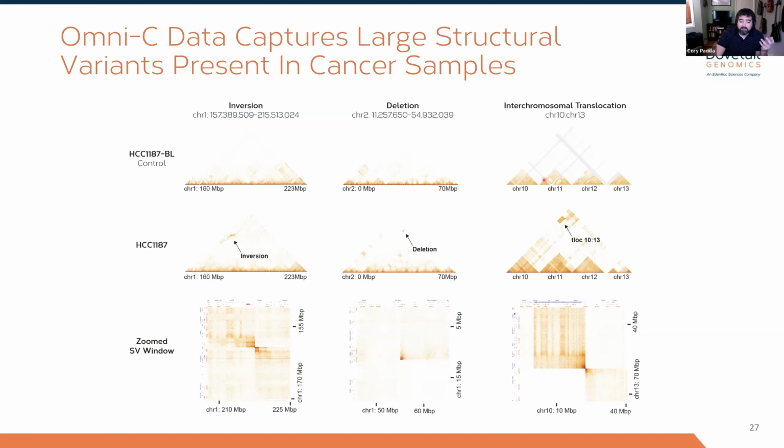And then the nice thing about this is you could zoom in on these SVs and start looking at what the gene landscape is around these regions. Or conversely, like I said earlier, you could reassemble and look at the topology de novo for these cell lines, right? And then do a genome to genome comparison to a normal. So, all right, that is another powerful data type here where we're allowing you to capture those single nucleotide polymorphisms, and we're allowing you to capture these large structural variants.